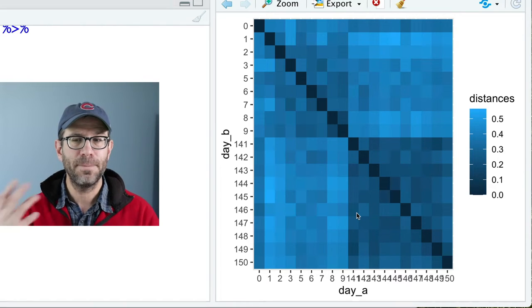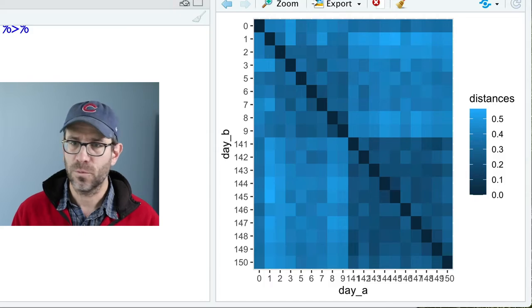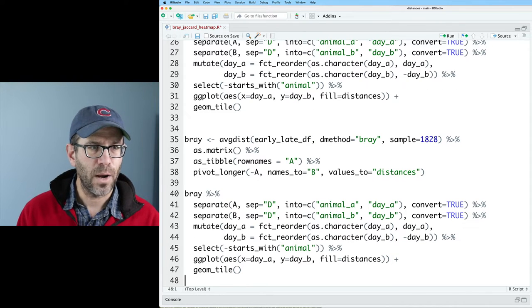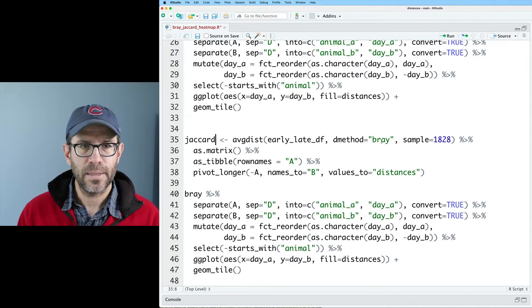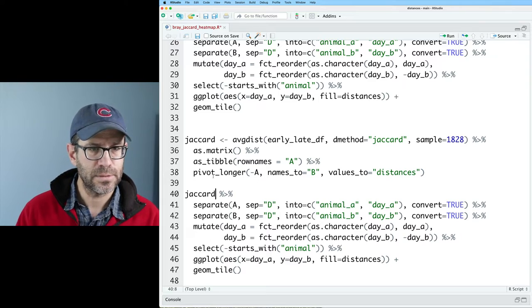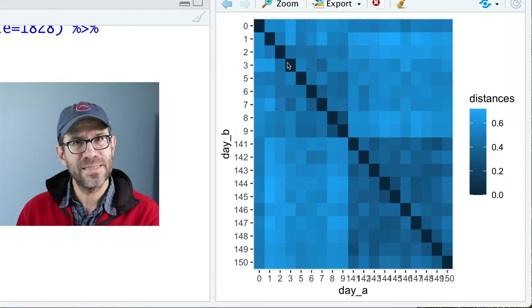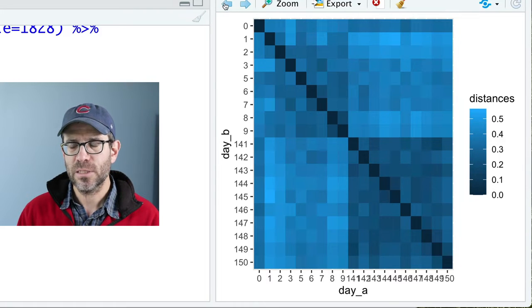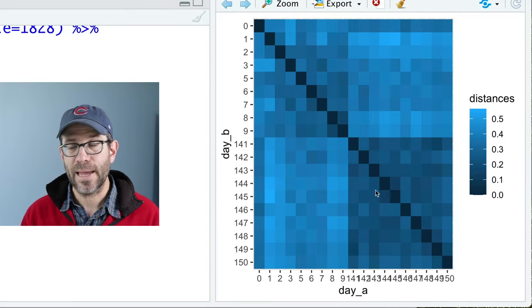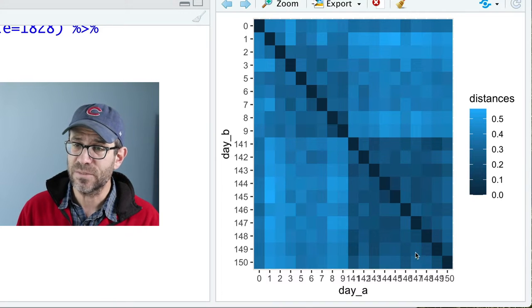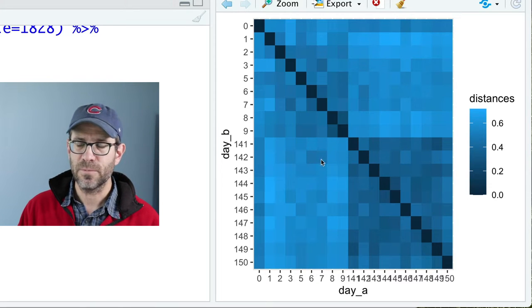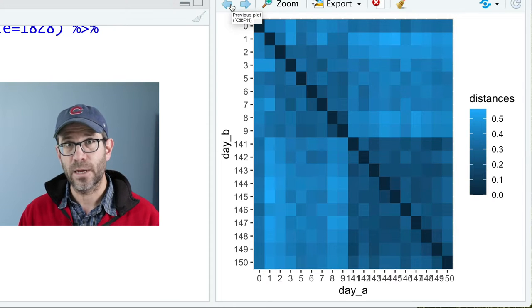The Jaccard code is very similar to what we've already done. I'll copy the Bray code, call the variable Jaccard, and change the method from 'bray' to 'jaccard'. Feeding Jaccard into the same pipeline should just work. Now we have the heat map for Jaccard and the one for Bray-Curtis. The darker colors mean samples were more similar — that's why the diagonal is dark, because those have a distance of zero. The Jaccard distances are larger than Bray-Curtis, so those tiles are a bit lighter.